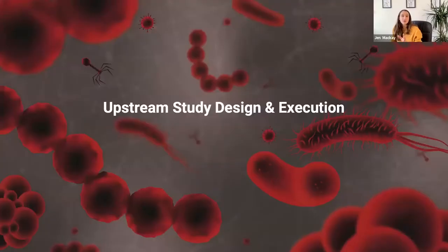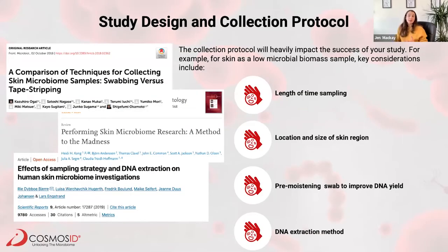So starting with the study design, we of course begin with sample collection, something that can often be overlooked. It's perhaps a little bit boring, but is really incredibly important in the success of any microbiome study. There are various papers that look at how different collection methods will impact the results. The overriding theme is that you need to make sure the protocol is exactly the same per sample for the results to be truly comparable. So standardization is key here.